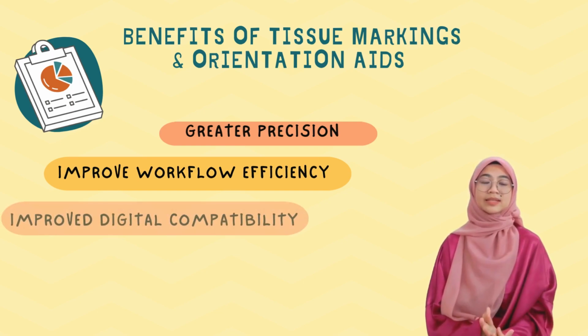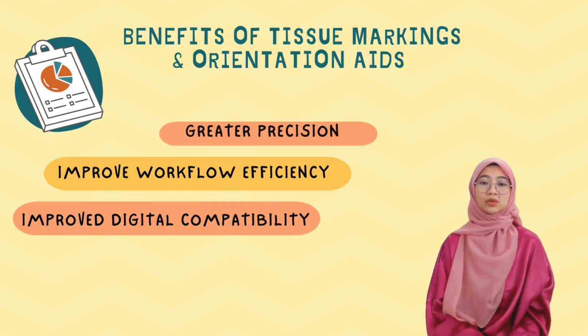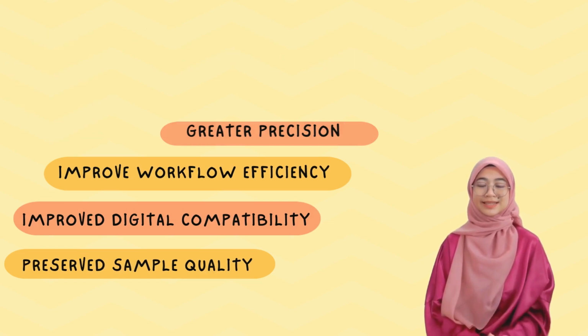The third one is improved digital compatibility, where laboratories are able to work seamlessly with digital imaging through fluorescent dyes. And last but not least, preserved sample quality. This is because there are no added chemicals to interfere with tissue analysis.